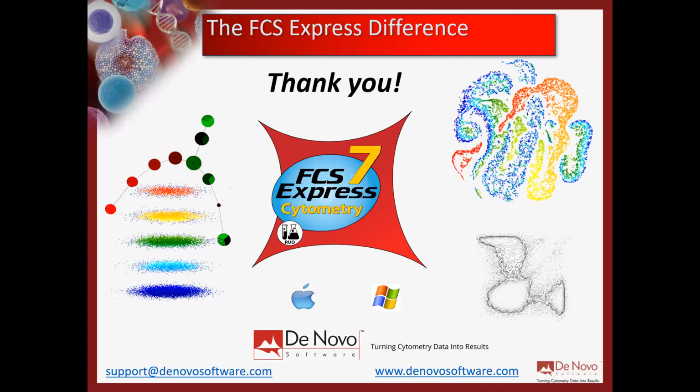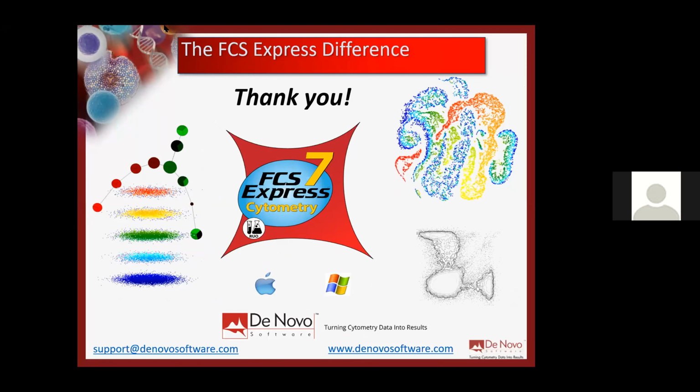All right, and I don't see any additional questions coming through the chat now. So again, what I should mention, I know folks will have questions after the call. That's fine. You can direct those to support@DeNovoSoftware.com. I challenge you to test out our team, see how fast we get back to you. I think you're going to really appreciate how fast our team works with you.